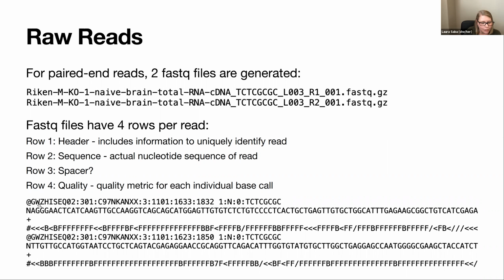And so, for example, these particular reads, sequencing was done at GeneWiz, and so that's their little symbol here, GW, and then it was run on their HiSeq. The next line is the actual base pair calls, then a little bit of a spacer. And then these letters actually correspond to the quality of the call for each of these base pairs.